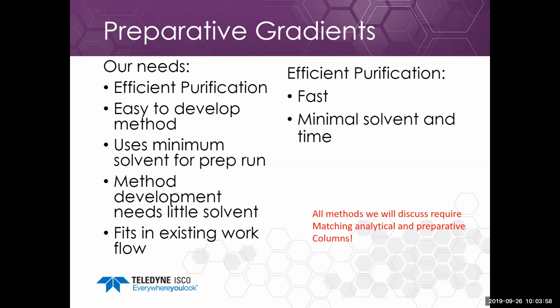C18 comes in a number of different sub-chemistries, if you want to phrase it. There's C18AQ, you have C18 that might be bonded, say, to a polymer, and that's going to run a bit differently than a simple end cap C18. And so if the compound elutes a little bit differently with the different C18s, going from an analytical to prep won't work very well. You're going to have selectivity differences. As an example, running a Phenomenex analytical in the Waters prep column won't work very well.